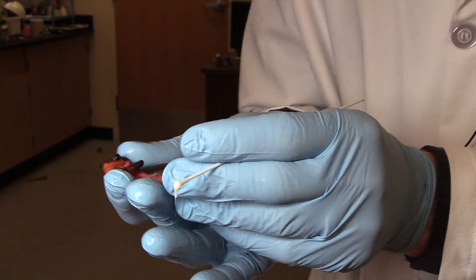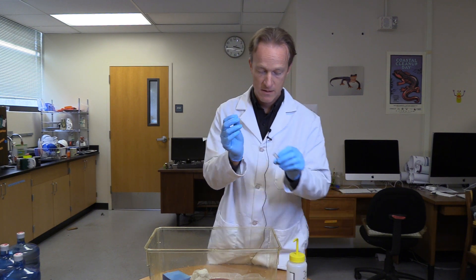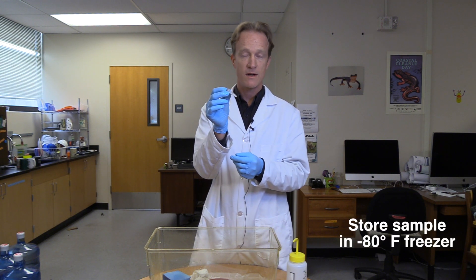That's about 30 seconds. He's ready to go back home. Break off my swab, put it in my vial, lock that lid on, and now it's ready for the minus 80 freezer.